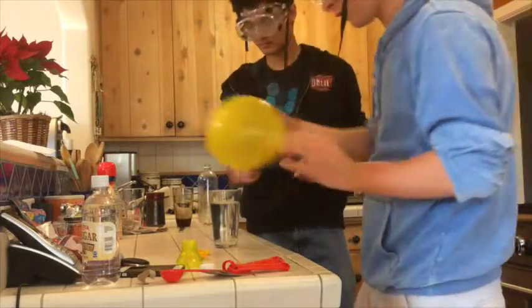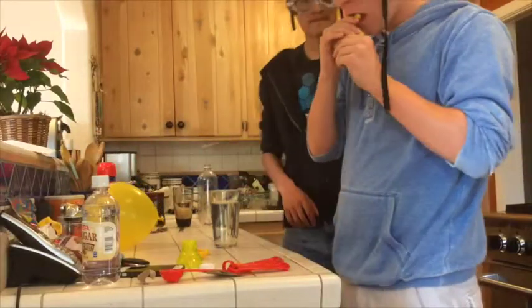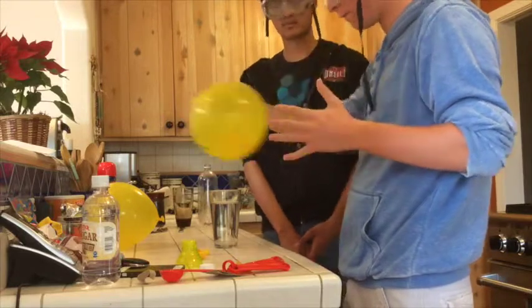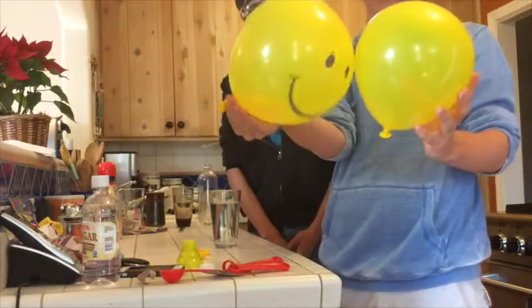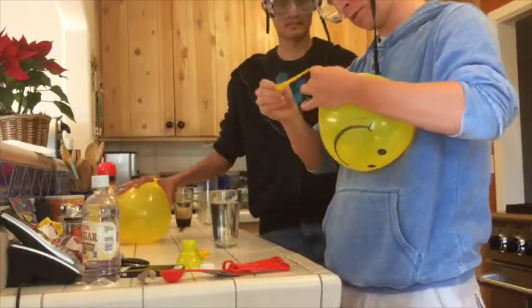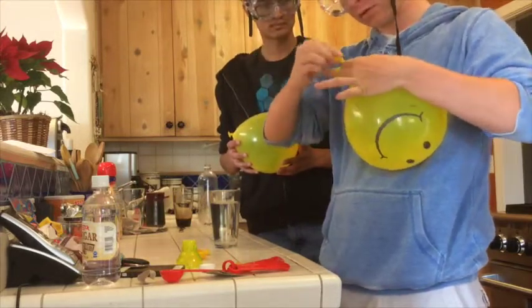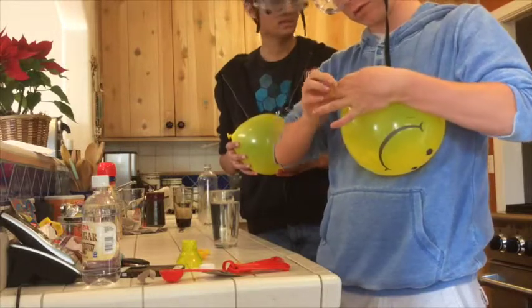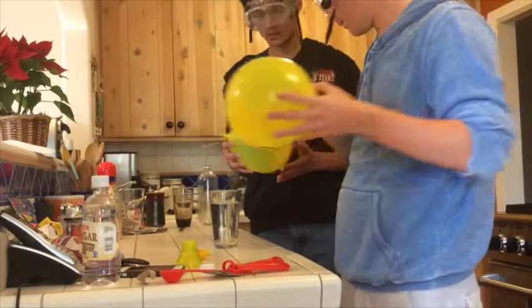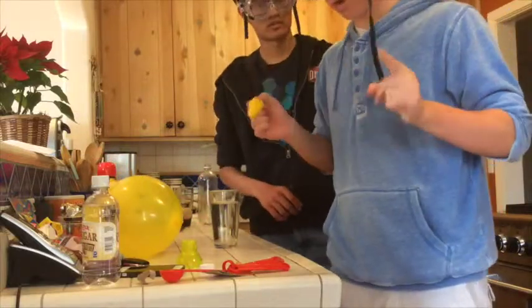Okay, here's one. You've got to compare them, see if they're roughly the same size. And here's the second one. All right, now, as for the third one, we are going to move over to the stove.